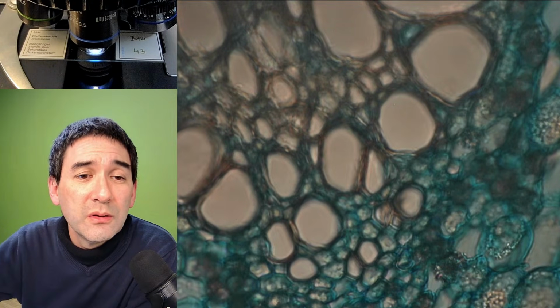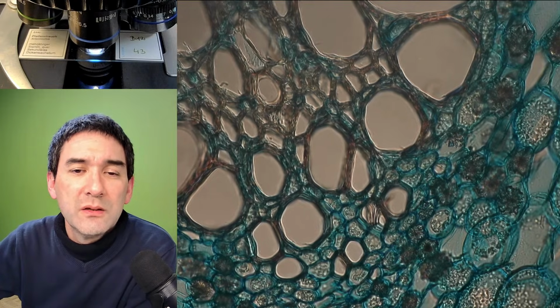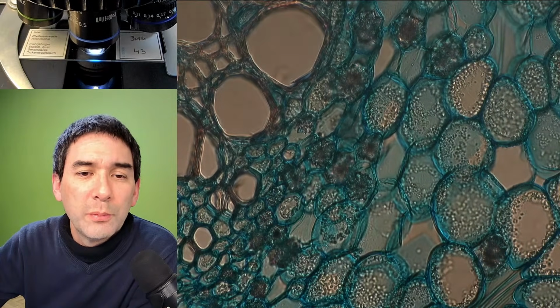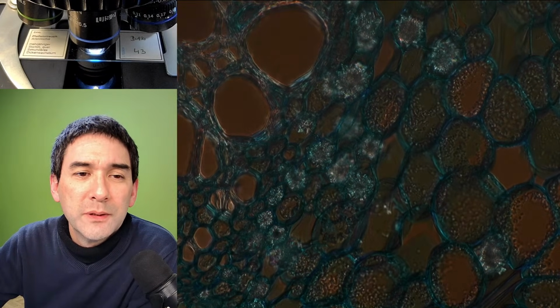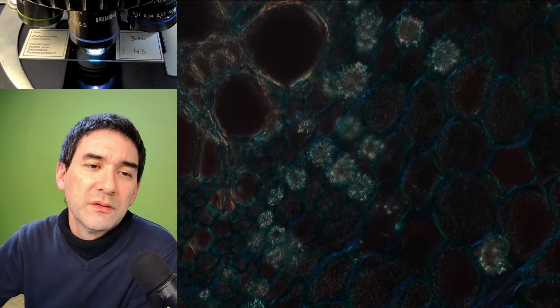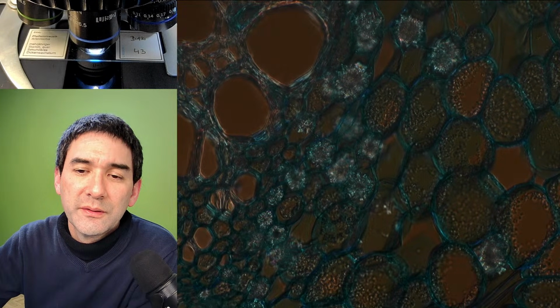Let's focus. And that would be now DIC. And you see, there's not a huge difference. I can play around a little bit with the top prism, right? Over here. Ah, look, this looks interesting. It's almost, maybe there are some crystalline structures in there.